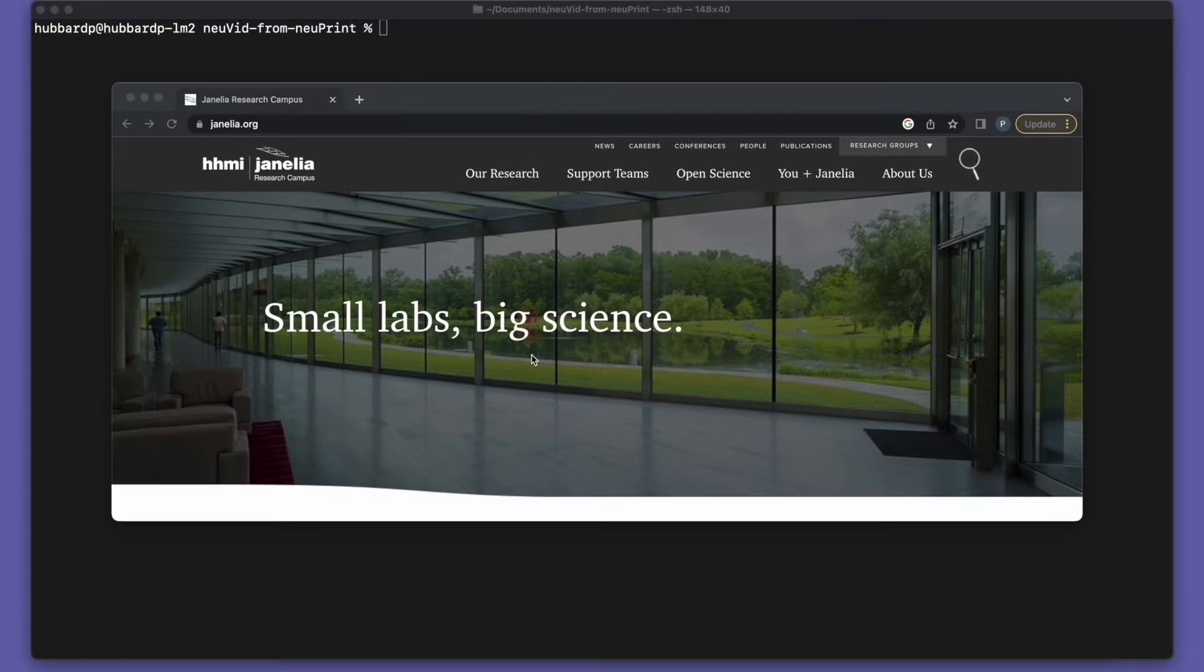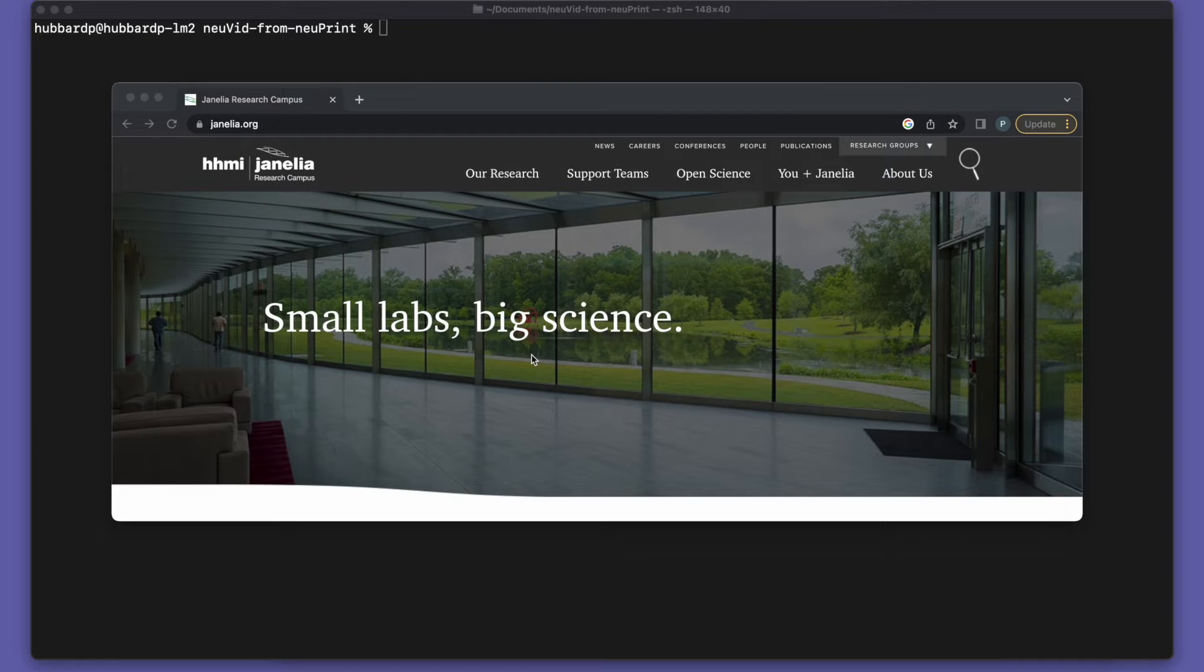The setup is easy and the hands-on time is only a few minutes, so I hope you'll give it a try. Let's get started. The setup just involves two steps, installing Blender and installing NuVid.